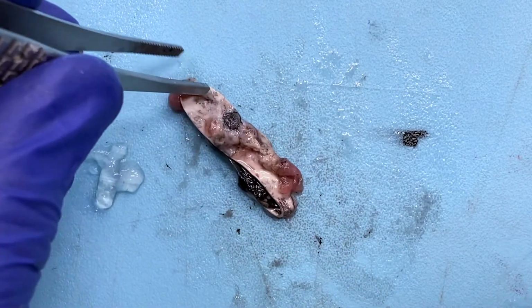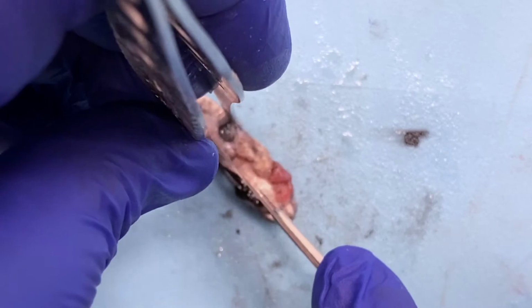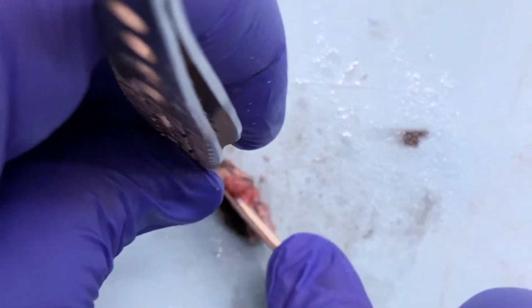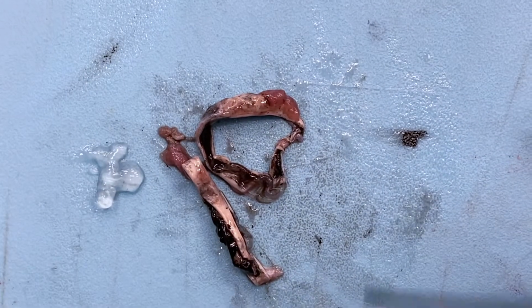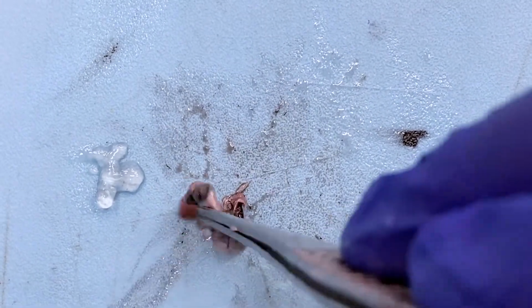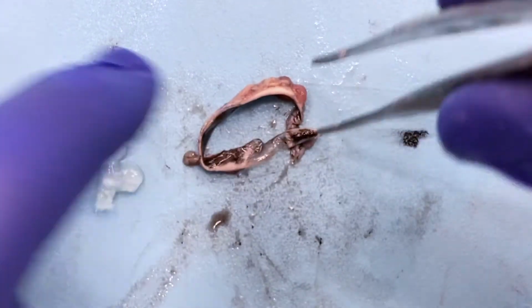There's my pupil. Now that it's nice and flat and easy to work with, I'm going to go ahead and trim the other side of this eye, and leave us with a nice thin section that contains everything we need.